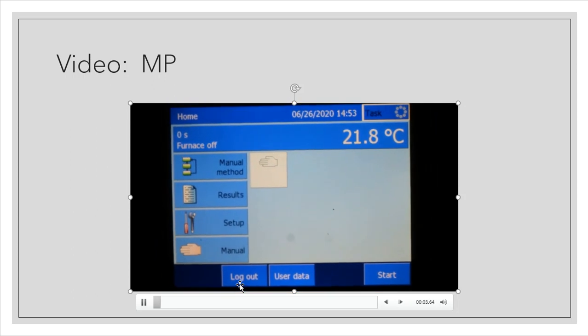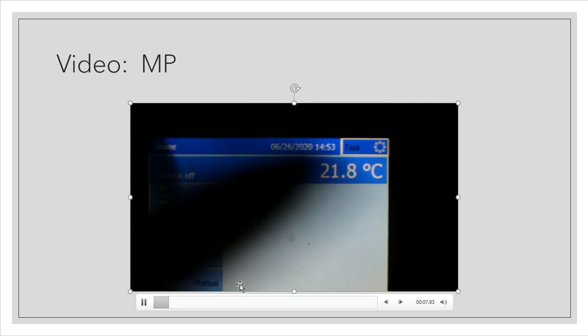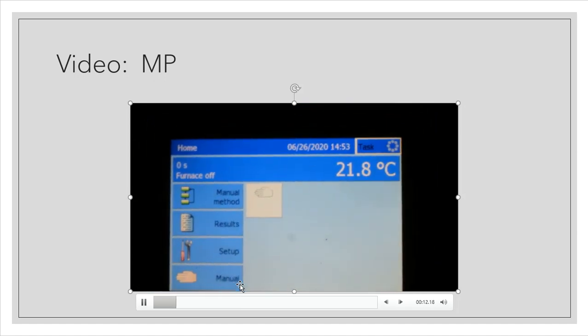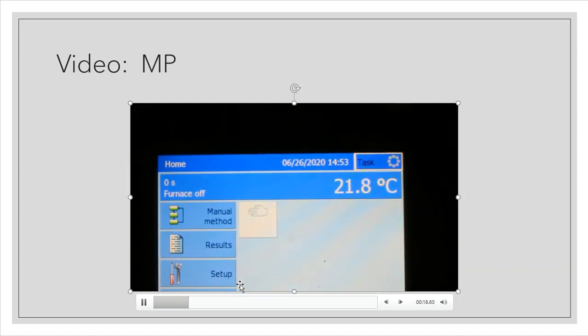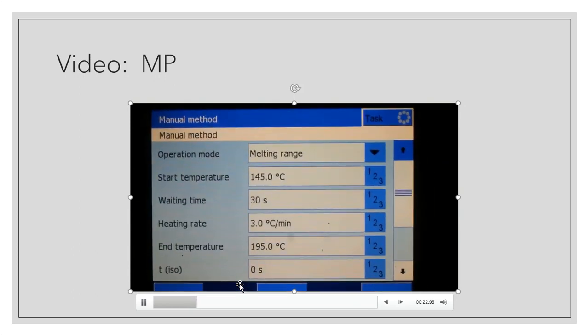So I'm getting ready to put my cinnamic acid product into the melting point system. Just so that you know the steps of how to start up the MP50, maybe you didn't get that last time, so we're going to talk about it again. I'm going to turn the power button on. The power button is up here in the top right-hand corner. This is the home screen. I'm going to go into manual method.